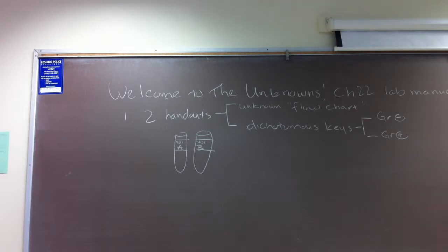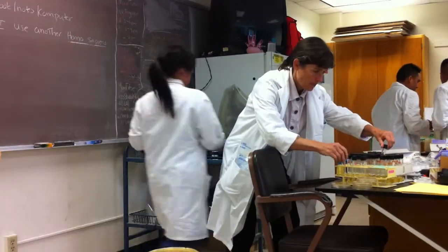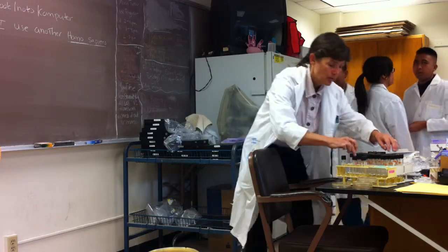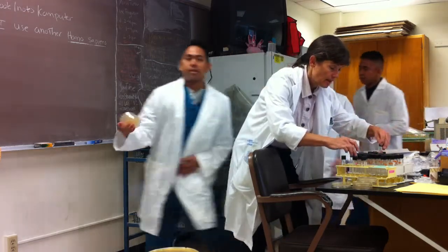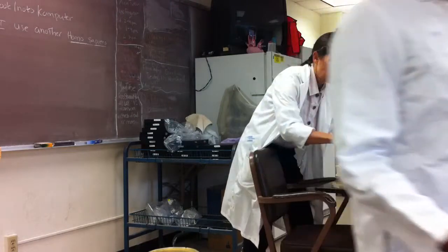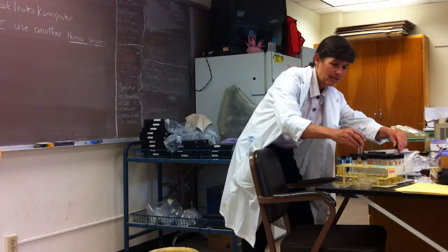Okay, each person needs 4 TSA plates. And I'm just getting our unknowns ready here, because what I'm next going to do is bring the unknowns around for you, so that each of you can choose your unknown. Hopefully this will make a little bit more sense as we're discussing it.